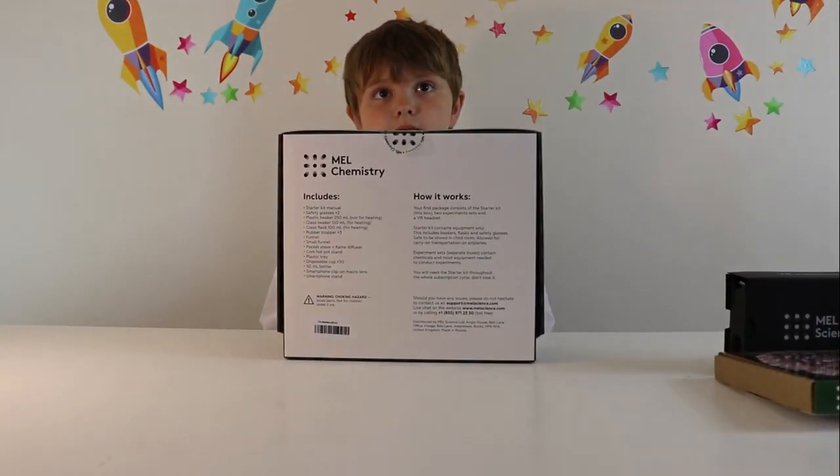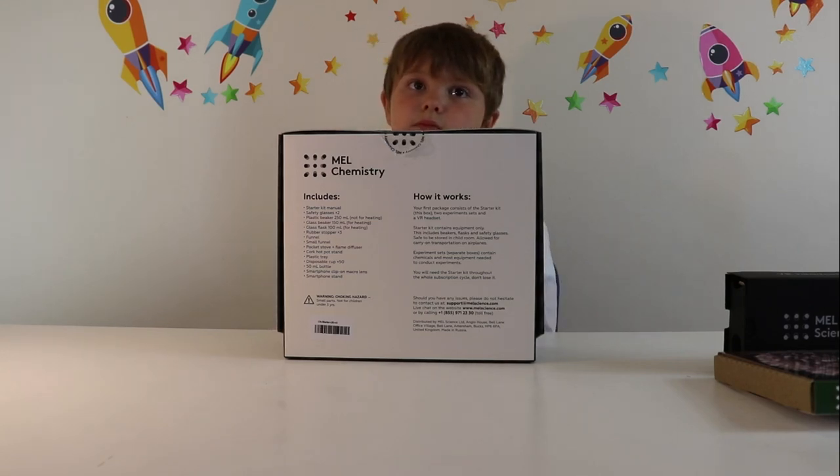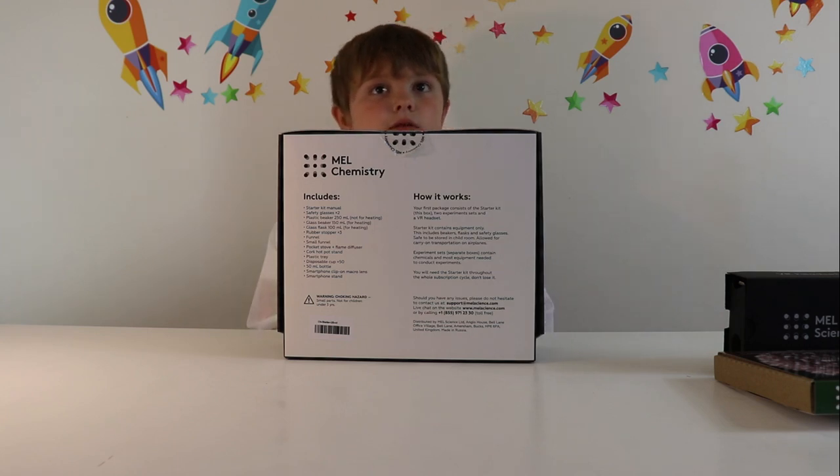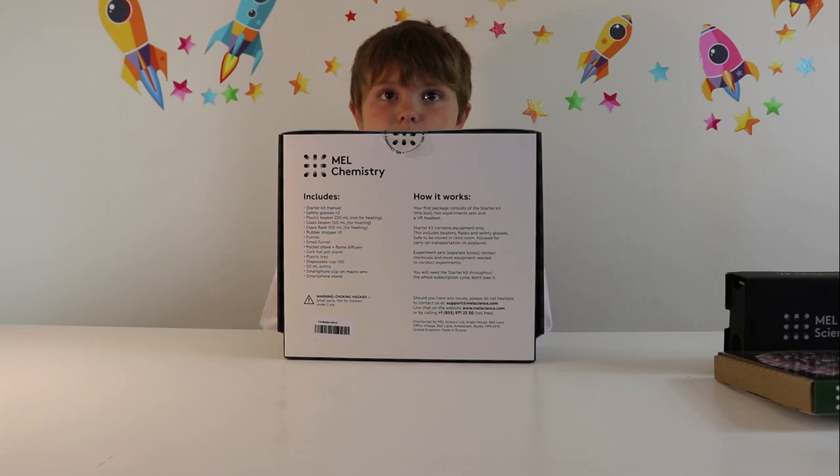So you get a manual, safety glasses, plastic beaker, glass beaker, glass flask, rubber stoppers, funnels, a stove and a flame diffuser, cork hot pot stand, plastic tray, disposable cups — 50 of them — and a 50ml bottle.